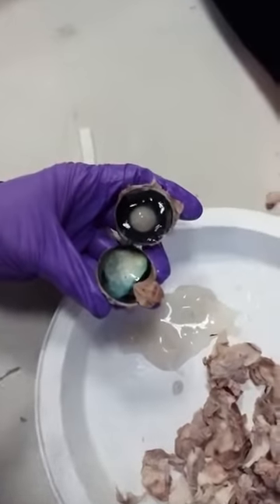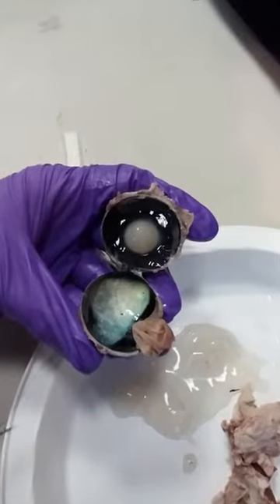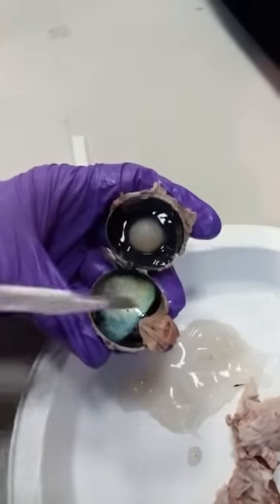This shiny surface here is called the tapetum lucidum, and that's what helps animals see in the dark. It acts like a mirror by reflecting light around the inside of the eyeball and magnifying the light so that they can see in the dark.